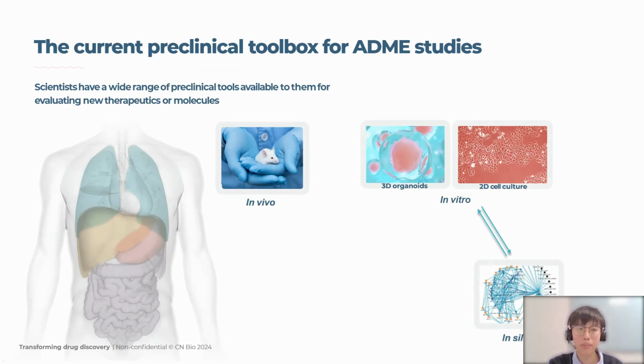To estimate the ADME in preclinical studies, scientists have a wide range of tools available to them for evaluating new therapeutics and molecules. One of the most common approaches is the in vivo approach using animal models, which I'll go through the benefits and the challenges of in the next slide. Some scientists will also be using 2D cell culture and 3D organoids for their studies, and this is part of the in vitro toolbox. In vitro methods sometimes could be used in conjunction with in silico methods such as mathematical modeling to estimate the ADME profile of a drug.